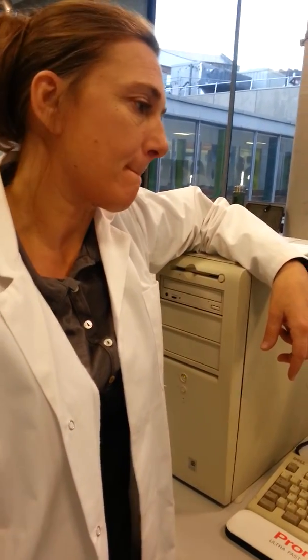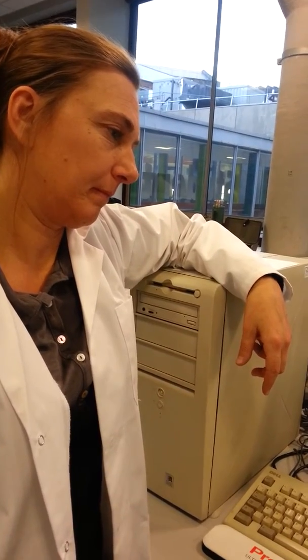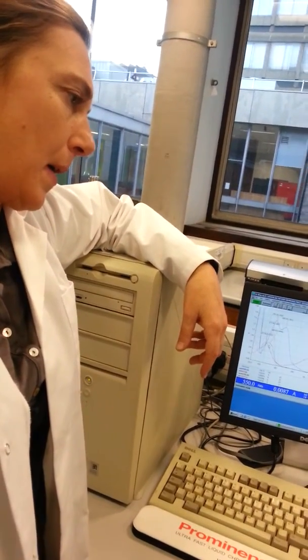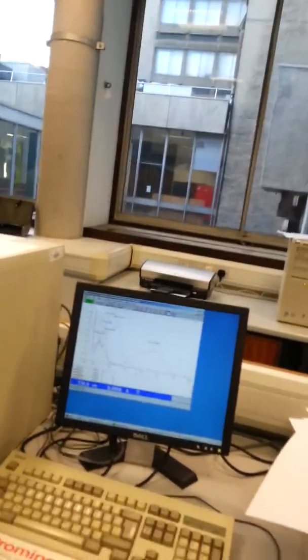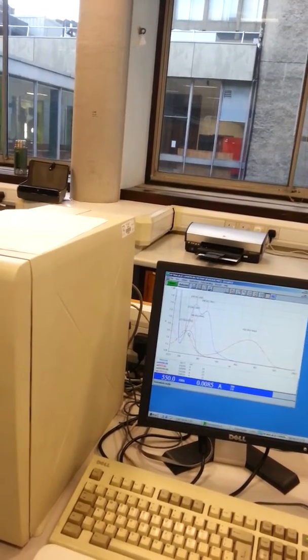So hang on a second. That's just the crux of it, I see. That's the bottom line. If we just quickly write on here, this is a spare one, so that there is the absorbance. Yeah, there's no units for absorbance. And this one here is the wavelength. Okay, and there's no units for the wavelength either, is there? Yeah, the actual symbol for wavelength... Oh, hang on, no, I've done it wrong. That's all right. It's just this, isn't it? Wavelength, and then you put max when it's a peak next to it. Okay, so this here is lambda. So that's the max. Max, yeah.